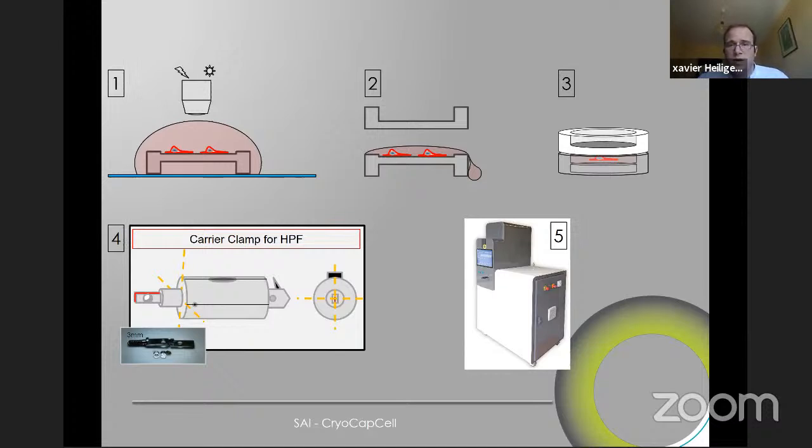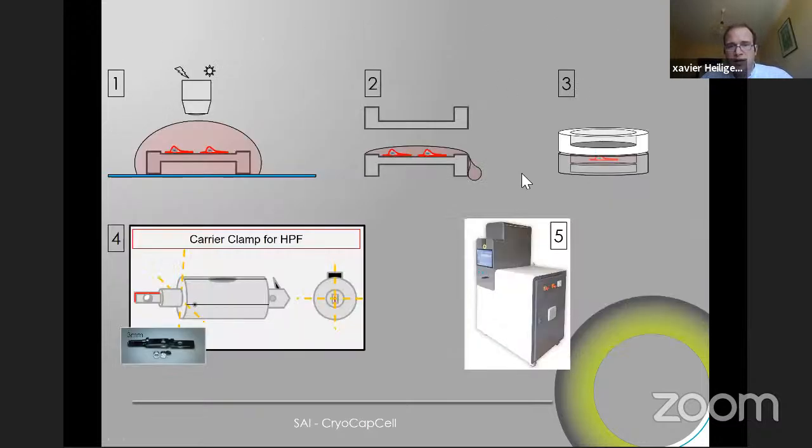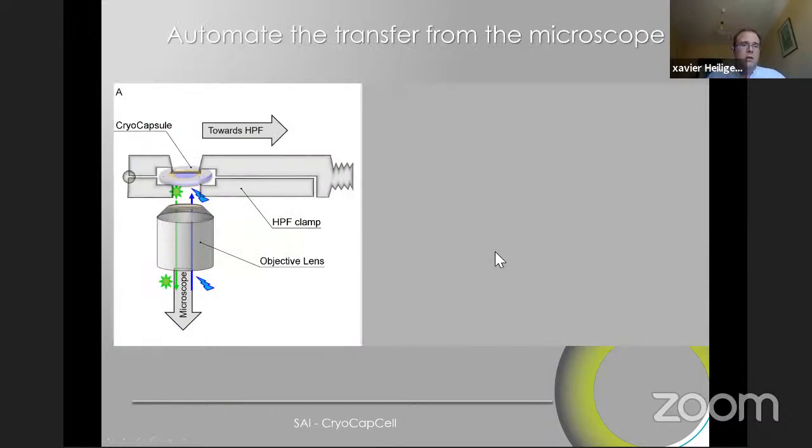So what we wanted was to be able to do live cell imaging and vitrify the sample as quickly as possible. So what we thought was, okay, to do all this small assembly you see here inside the handle of the HPM just before HPF. But then the manual transfer takes some time and is quite variable from one user to the other. So it's not really optimal. So what we wanted was to have the sample loaded at the end on an automated arm, just standing right above the microscope lens. So here, this is the microscope lens, and here, this is the cryo capsule that Pablo introduced to me before.